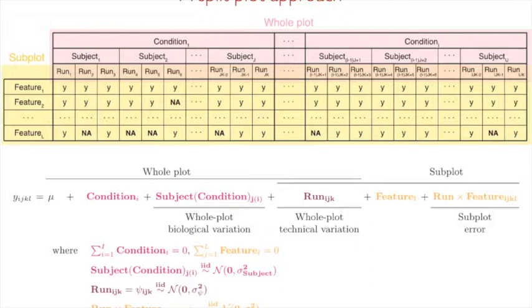And to make things more complicated, the patterns of missing values or low values or some unreliable values is very specific to the data processing tools. So if you quantify the peak abundances with Skyline, you may get different numbers than if you do it with OpenMS.